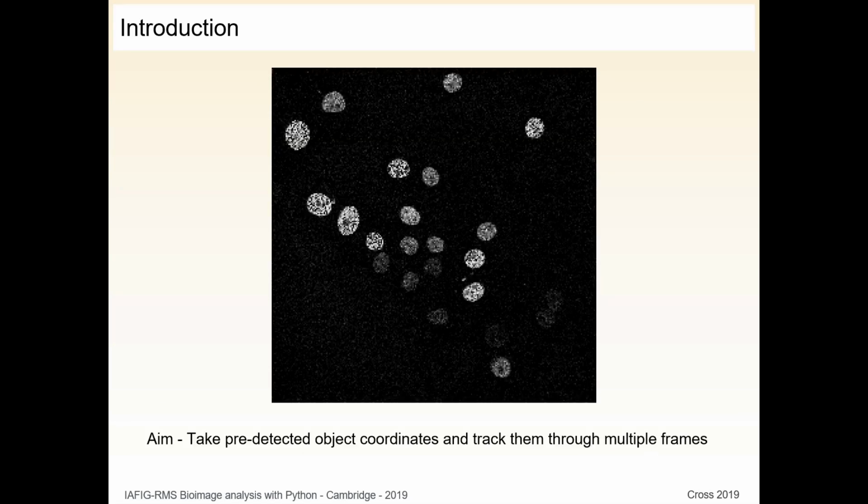In this session, we're going to assume that we're already able to detect objects and extract their centroid coordinates. The aim here is simply to take these pre-detected coordinates and track them through multiple frames.